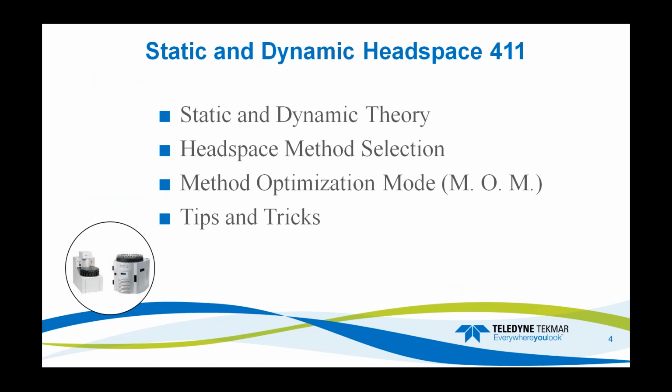Moving on to our webinar today, static and dynamic headspace 411, we're going to cover a little bit about static and dynamic theory. Then we're going to talk about headspace method selection, and we'll talk a little bit about the method optimization mode part for the sequence, and then I'm going to go into a little bit of the tips and tricks that we use to get these methods working.